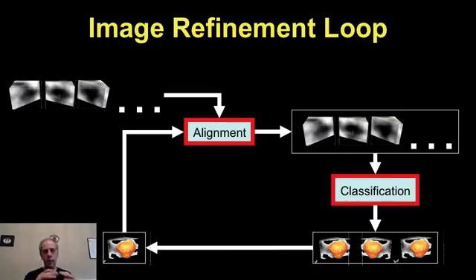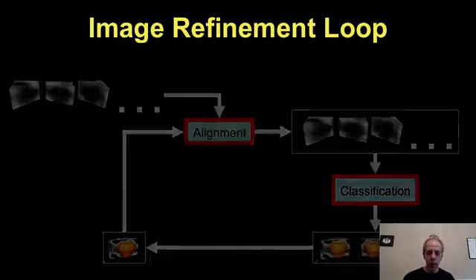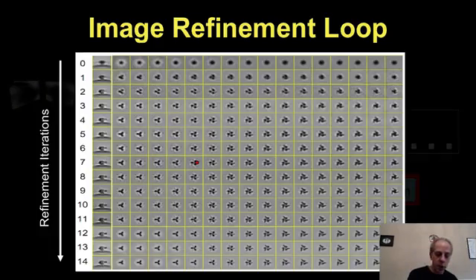You find the envelopes, you do the alignment, classification, and then you start seeing progress. You start from basically the very beginning, where nothing looks okay. If you average things which are completely non-aligned, you just get balls. It's just everything going in every direction. Then things start getting better. Things start to appear, and you start seeing shapes.